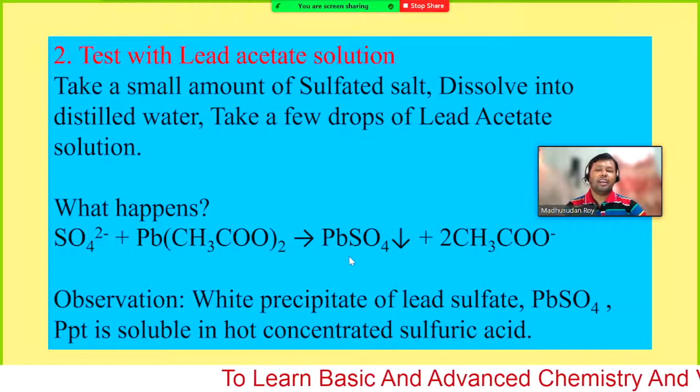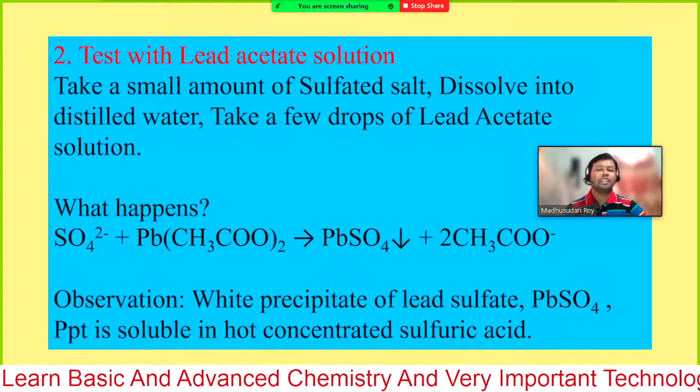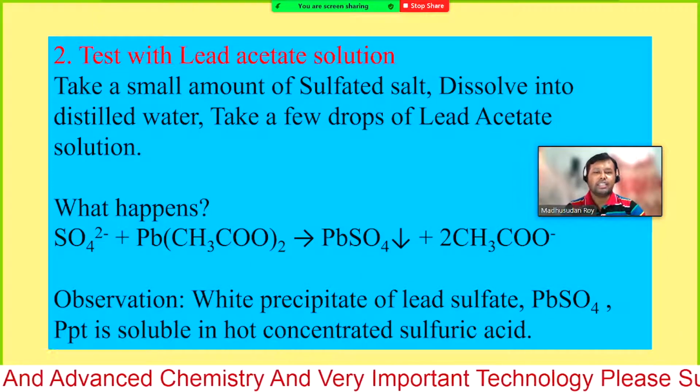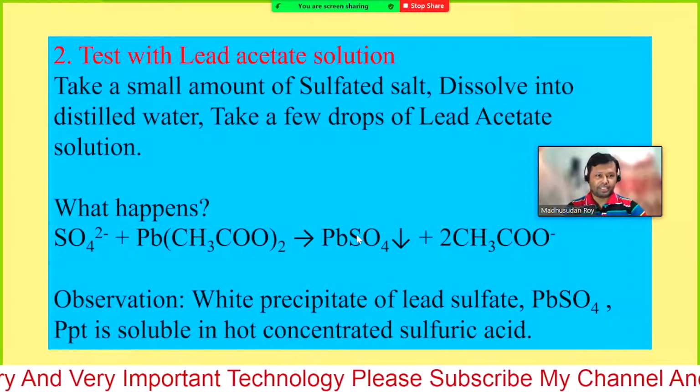One very strange or surprising thing is that in most of the tests we are discussing here, we are observing a white precipitate.